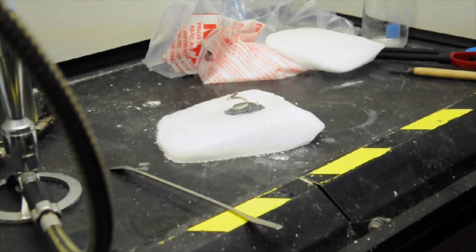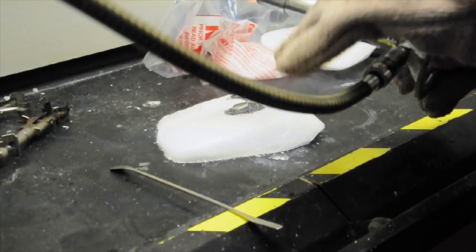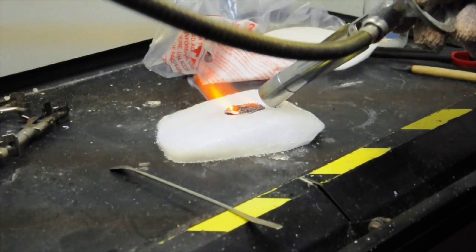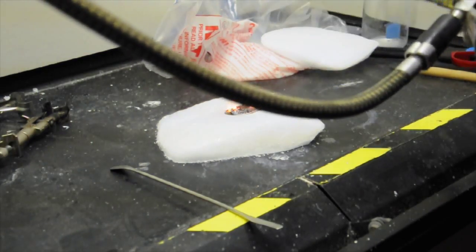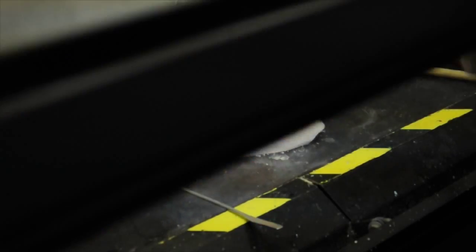The next step is to take the Bunsen burner and ignite the magnesium that is sitting inside the dry ice. Once you get a good flame going, the magnesium will be lit. Quickly take the top block of dry ice and place it over the base to cover the magnesium that is burning inside.